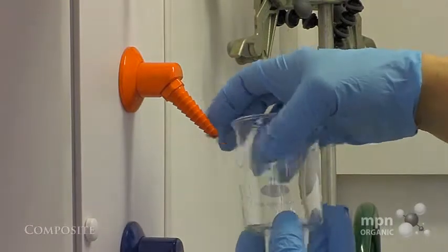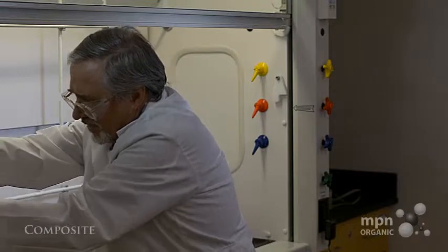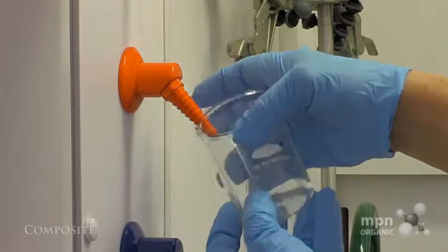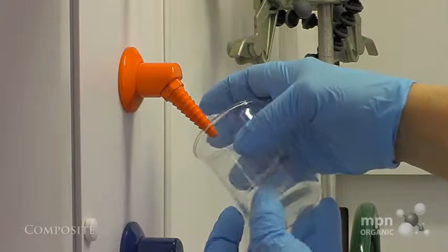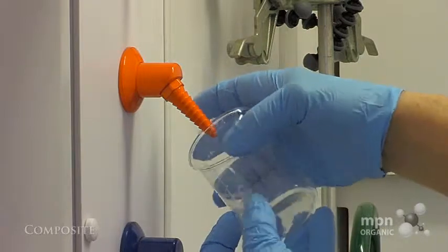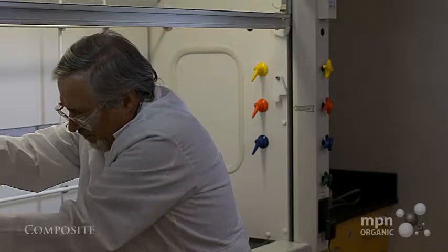So here we have our, let me warm this up then with my hand a little bit and make it evaporate a little bit more readily. Okay. So we're getting rid of the diethyl ether here, and if there's any acetone left in the ether, that'll also be volatilized away. We don't want acetone in here, remember, because it's going to give, first of all, a positive iodoform test, and it will also give a positive 2,4-DNP test.